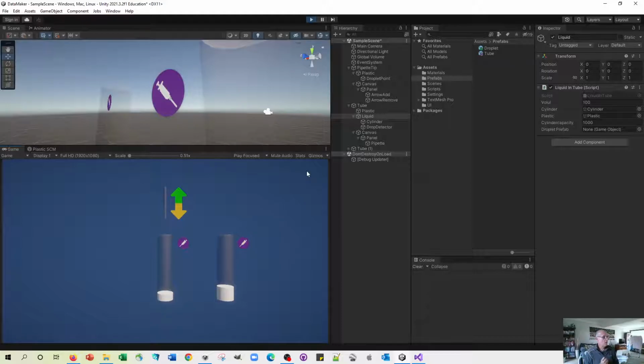We'll also maybe try and introduce some variation to the numbers that we're pipetting out and sucking up, so that we'll actually have some control over the volume. And also we might try and make it so that the pipette movement is a little bit more sophisticated, maybe going to the meniscus of the liquid as well. So there's a few extra little things that we can do, and that will be in the next session.